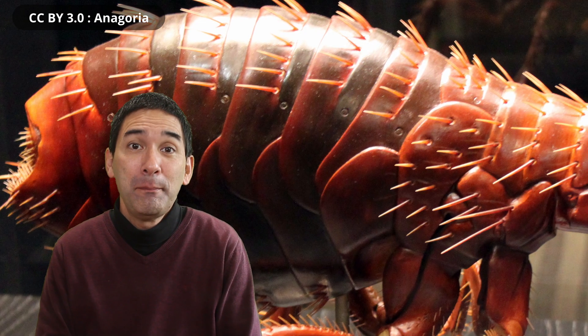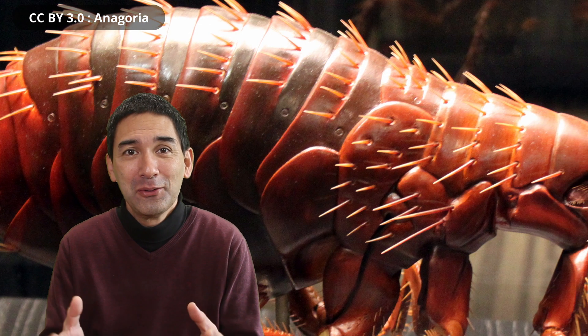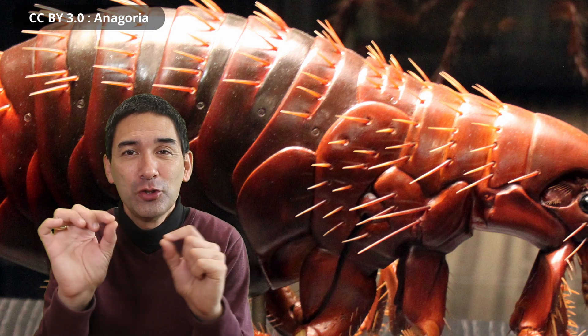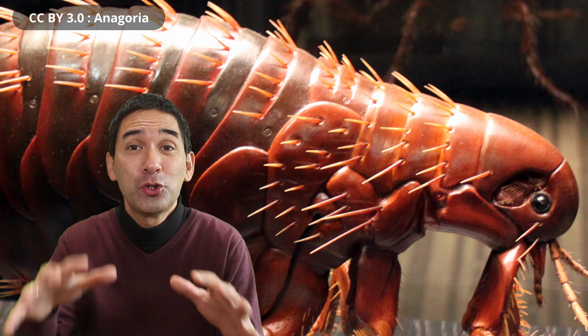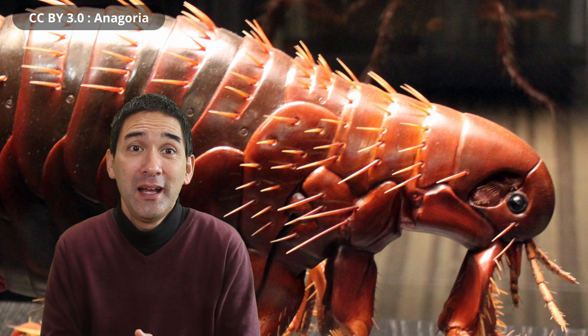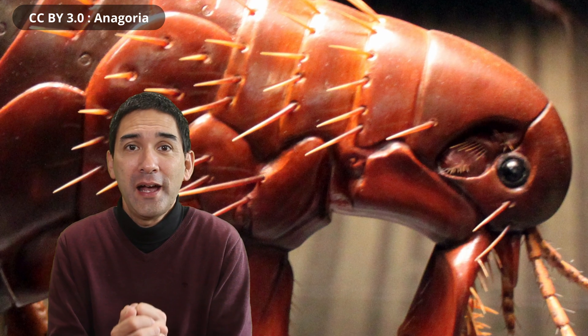Some of you might have pets at home, maybe dogs or cats, and you might be able to see sometimes strange little things, tiny things flying off the fur of the animal when you try to pet it. The things that jump off are fleas that live in the fur of the animal.